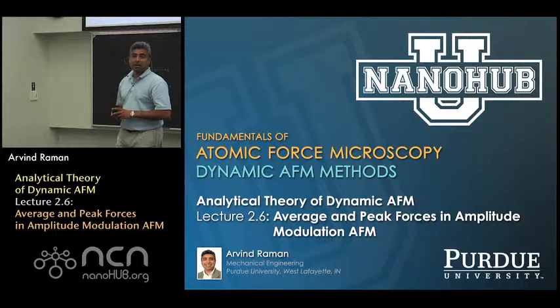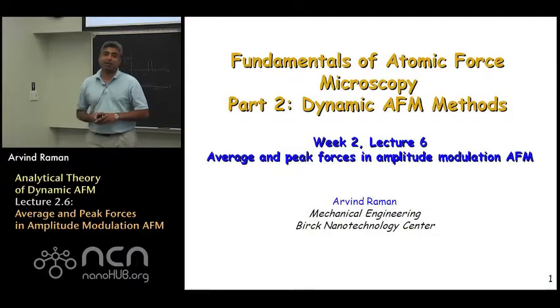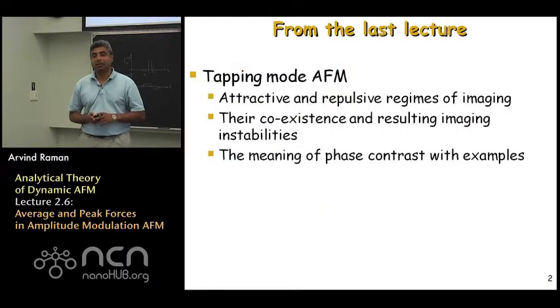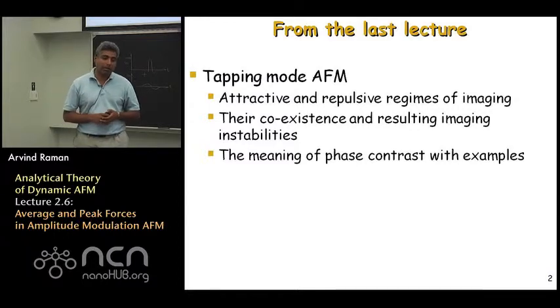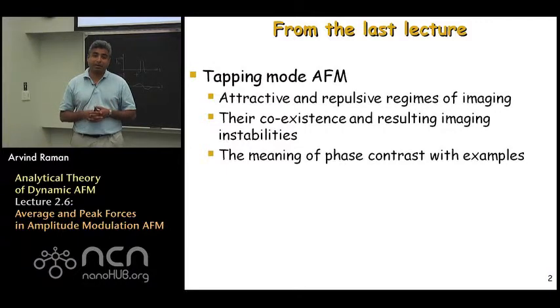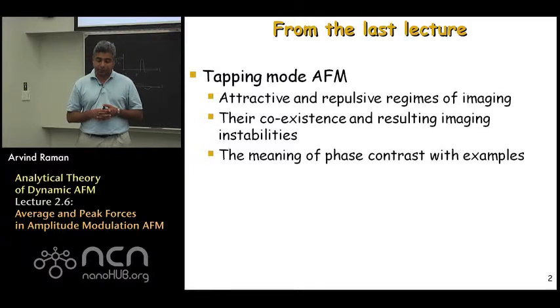nanoHUB-U, online instruction. Hi, and welcome to Week 2, Lecture 6 of Dynamic Atomic Force Microscopy Methods. In the last class and the classes before that, we've been focusing on the analytical theory of how we can link the observables in dynamic atomic force microscopy to the operating conditions of the microscope and the forces that are experienced by the tip, the sensor tip or the cantilever tip in the microscope.